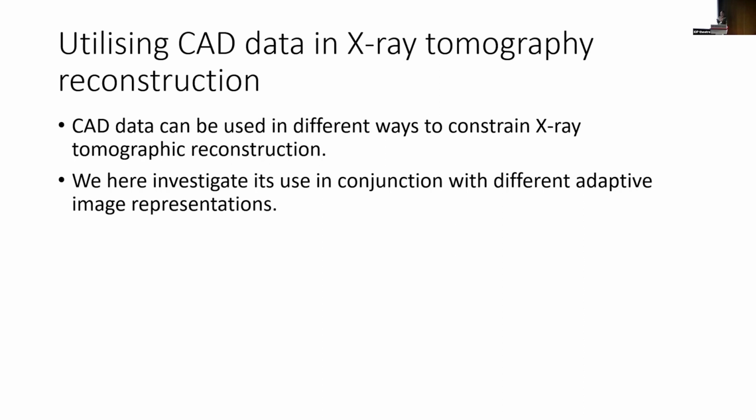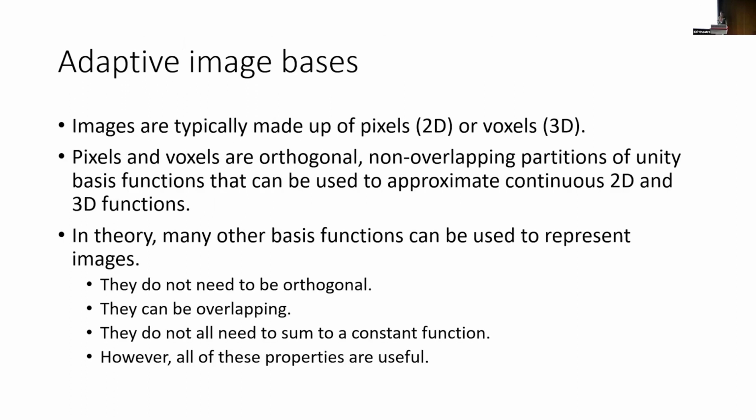Once we've reconstructed our image a bit, we might ask the question: is the basis I've chosen to represent my image actually the basis that's good for my image, as far as I know what the image looks like so far from my measurements? All right, so now I don't want to go through all the next few slides. I want to skip a few slides.